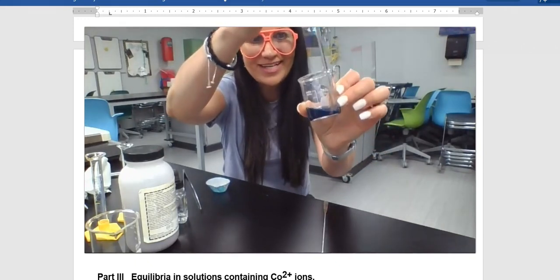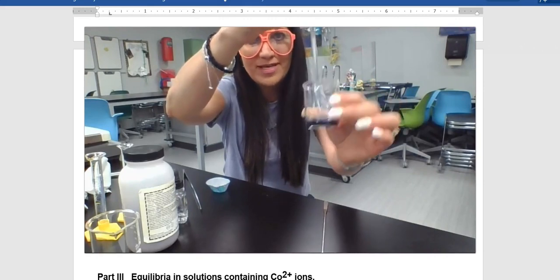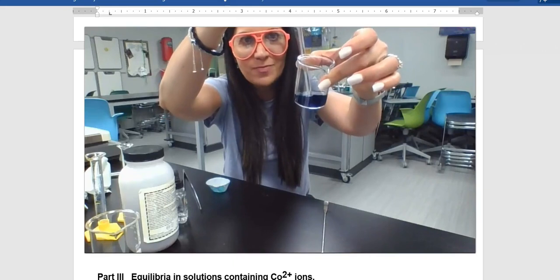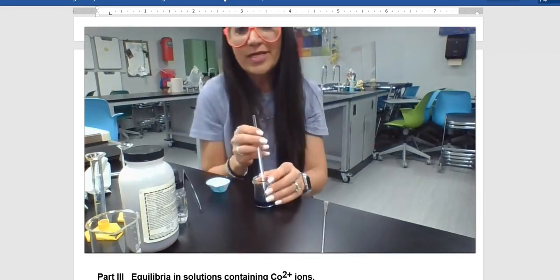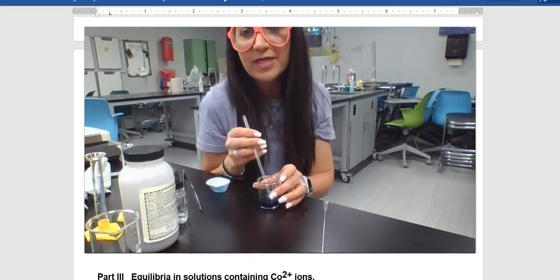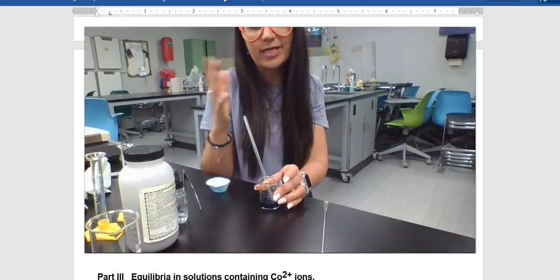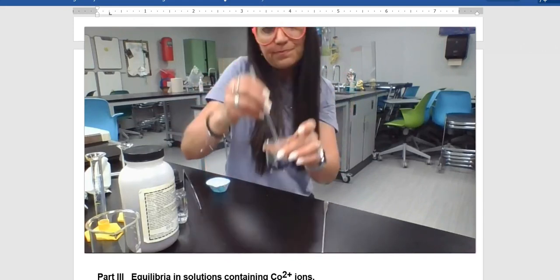It's like a purplish color, actually, okay? So that's a nice, pretty, kind of purple. I know it might look a little bit blue to you, but from my perspective, it's kind of violet. It's like a deep violet color, okay? So it says, you don't have to weigh out the chemical, just take as much as shown in the sample next to the bottle of chemical. We already did this anyway, and observe the color, okay? So that's our observation, this kind of purplish color.